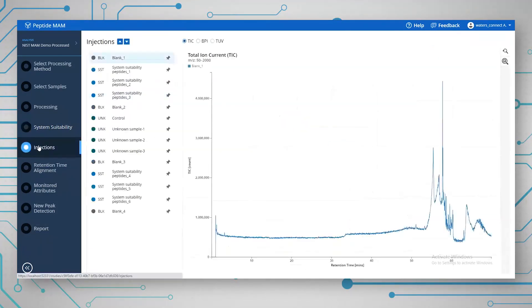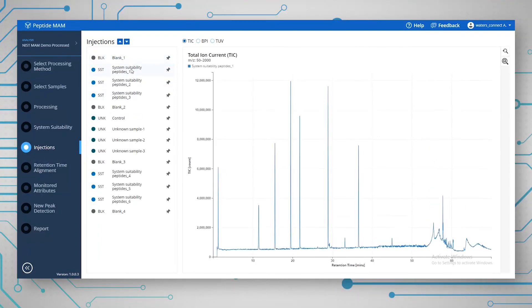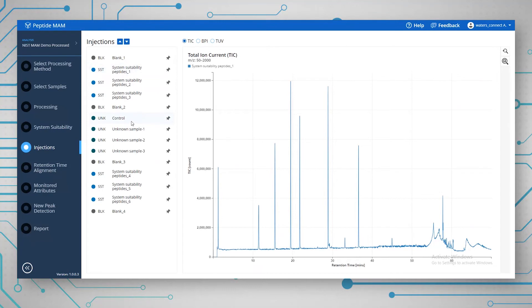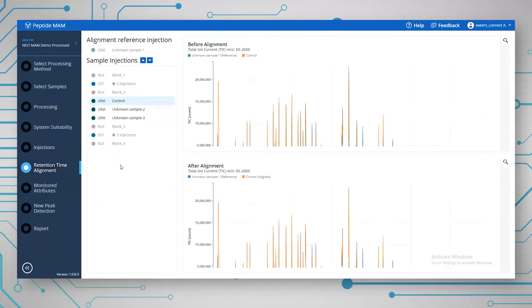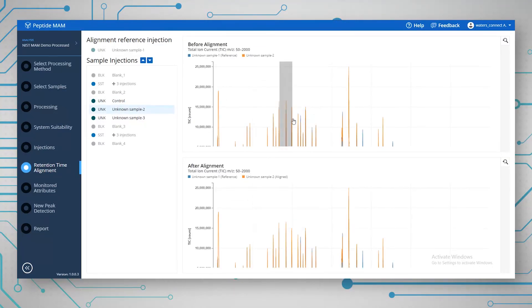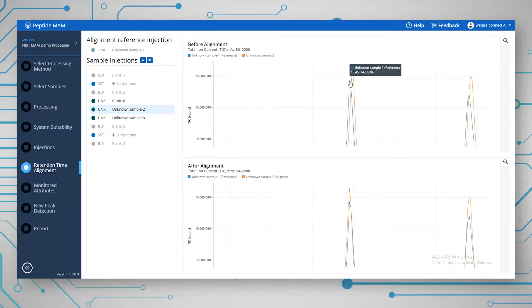Once you've checked the SST samples, we can look at the data from the injections. Looking at one of the NIST digests, we can toggle between TIC, BPI, and UV — you can see the nice data there. Looking at the retention time alignments, we can see what the sample looks like before and after alignment. You can see that before and after alignment there has been a slight adjustment.